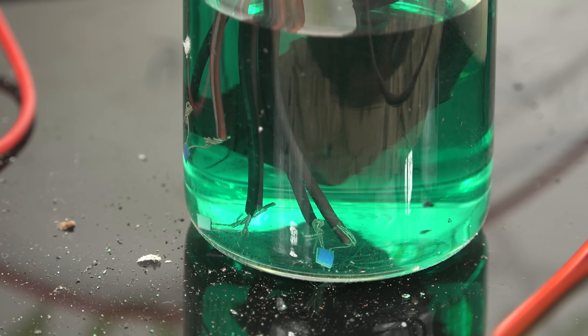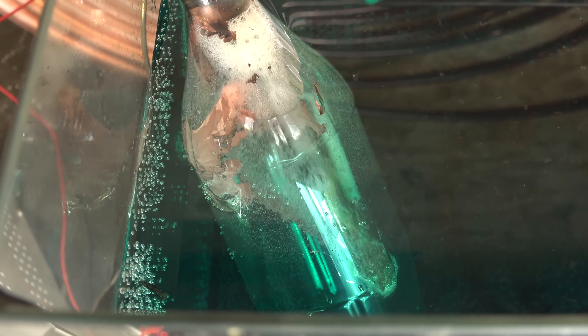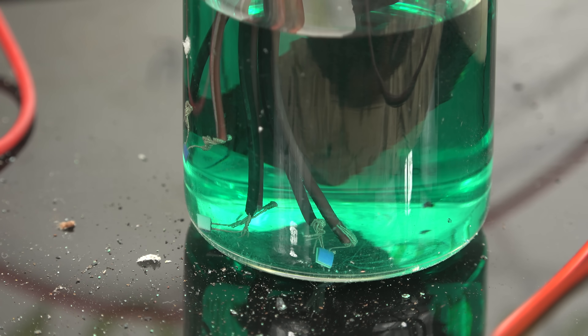You might ask why this copper deposit is strong enough to hold the wires together, but the deposit in the copper sulfate experiment was spongy and weak. The answer is that here I'm using very low current so the copper deposits slowly. When plating is slow, there is more time for copper atoms to crystallize electrolytically, forming strong connections. In the copper sulfate experiment the current was very high, forcing copper to deposit as fast as possible and resulting in weak, spongy deposits. So current control lets you control the strength of the copper deposit.